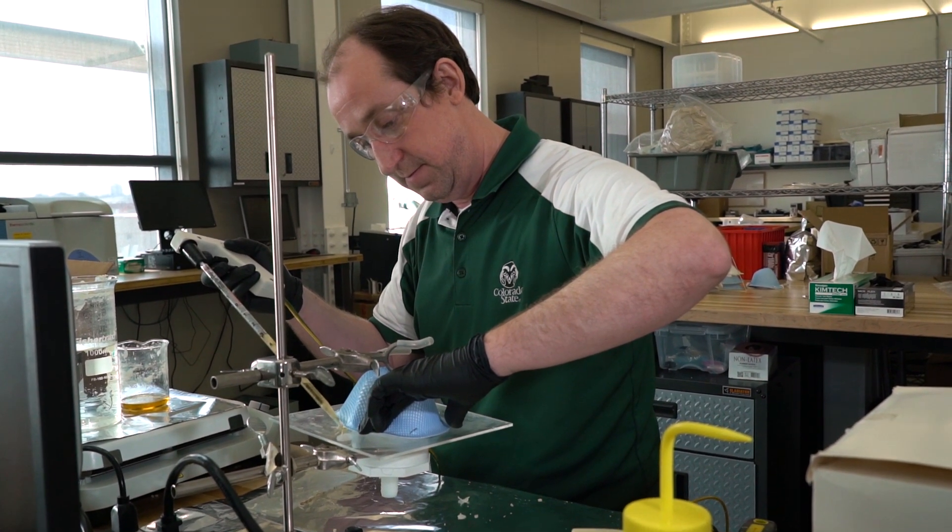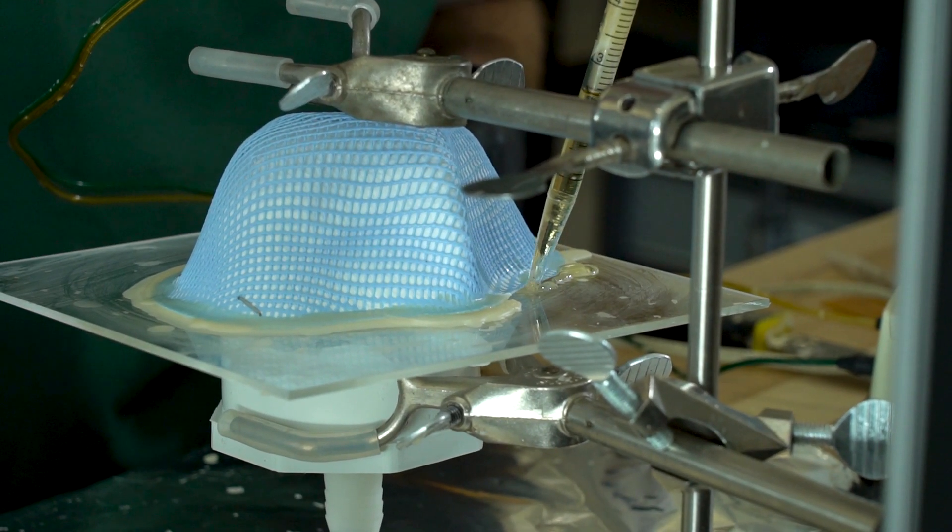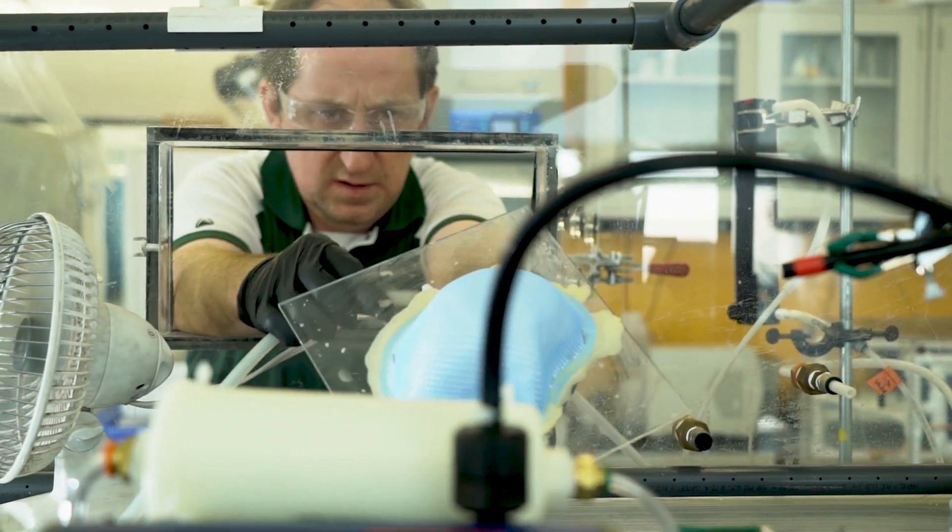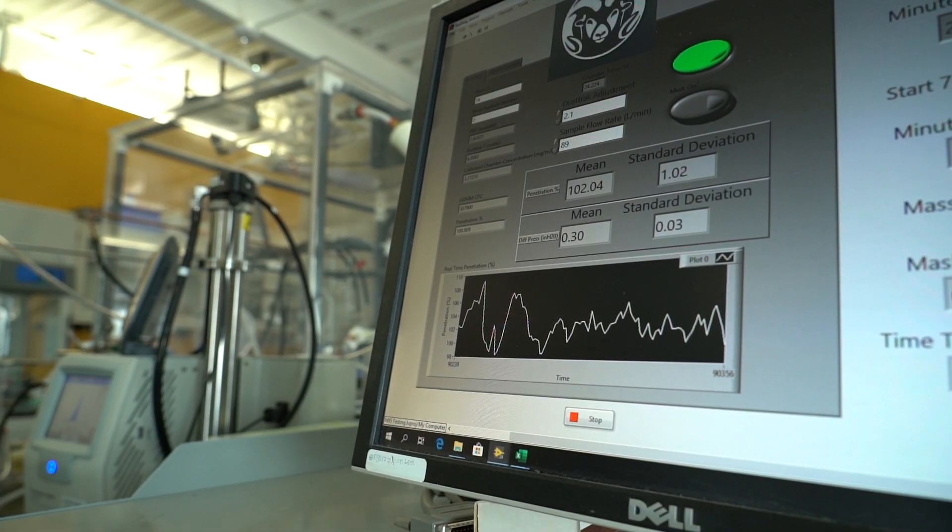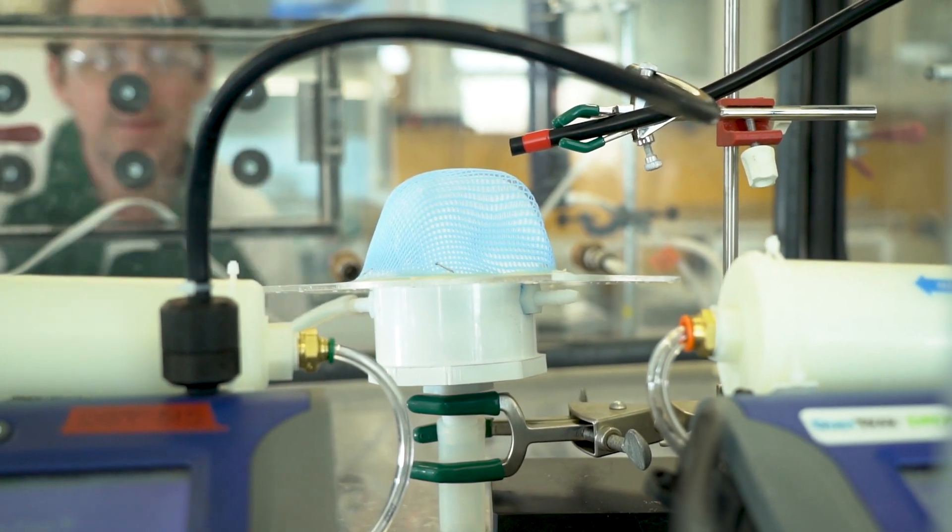The process in general starts with us taking a mask and sealing it down to a test fixture. It then goes into our aerosol chamber behind us where we flow air through the mask. We measure the amount of particles outside the mask and the number of particles in the mask. We can use that to get a really good estimation of how efficient the mask is.